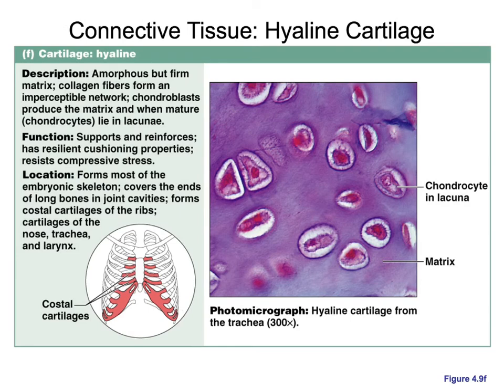You have three types of cartilage. Hyaline is one of them. The matrix here is glassy and smooth, and most of our slides are even smoother than appears here.